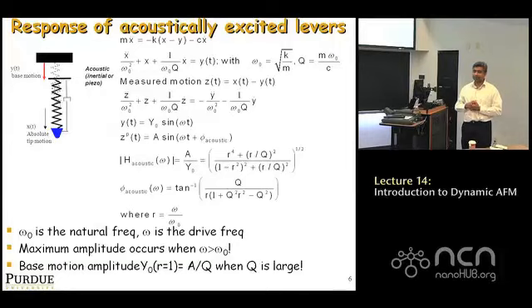So physically, if you're shaking slowly, like imagine, just slow this down. If you just take a cantilever beam, move it up and down, what amplitude would you measure using a photodiode on the cantilever? 0. Because it's not going to bend at low frequency, right? At low frequency, you just expect it to move up and down rigidly. If there's no bending, you won't get a signal.